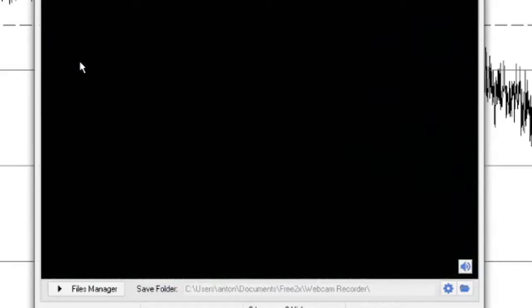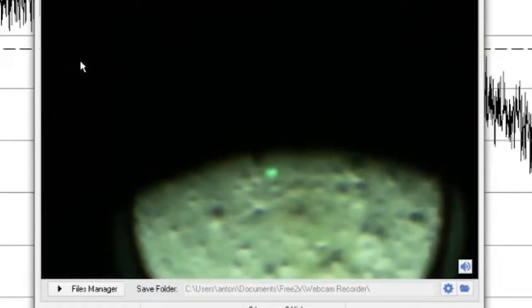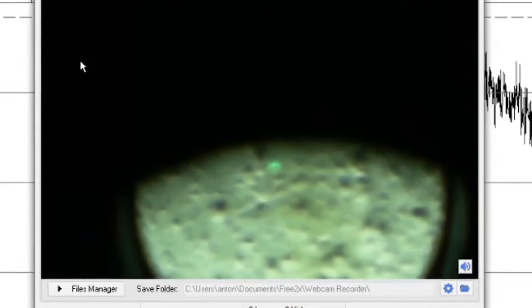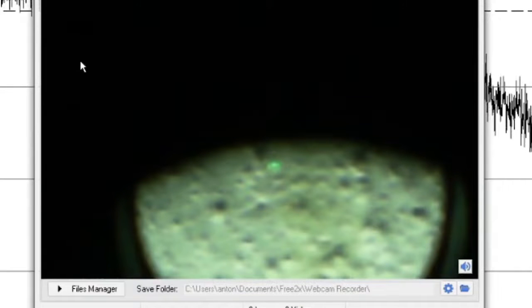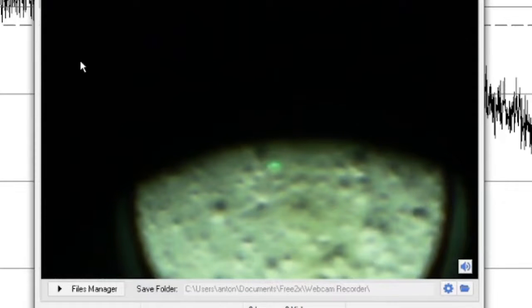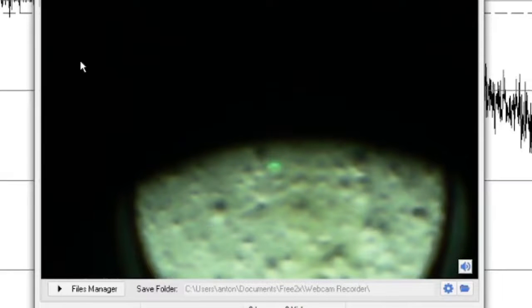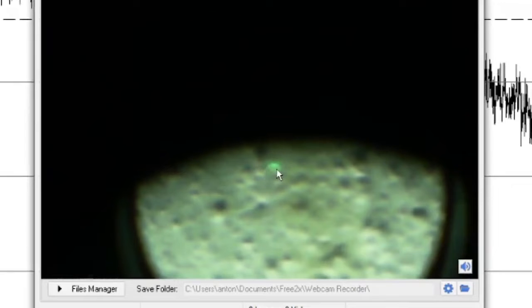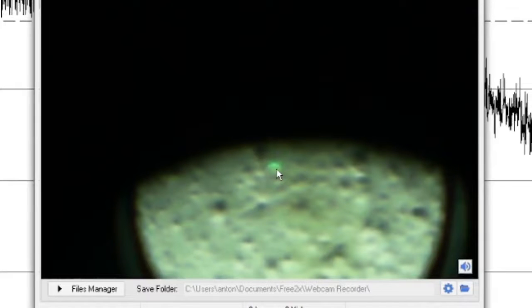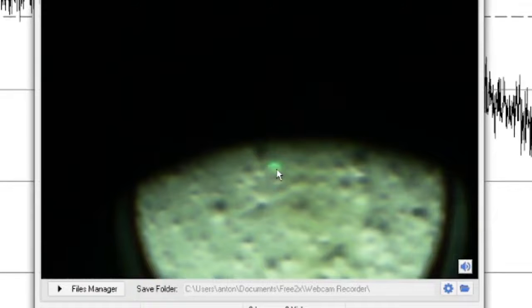When I'm moving this switch on and off, we have a position where we see the tiny green spot from the laser, just before it gets dark. In that area where there is the mouse. This is the laser touching the surface. So it's a very small spot.